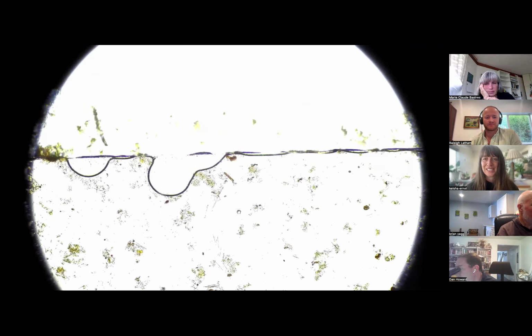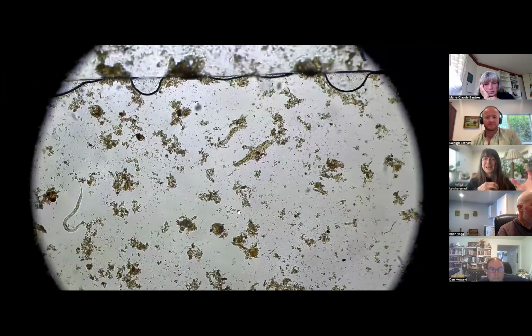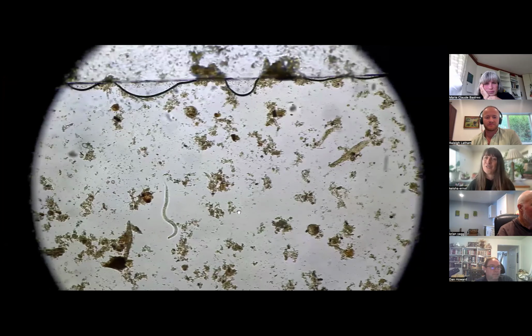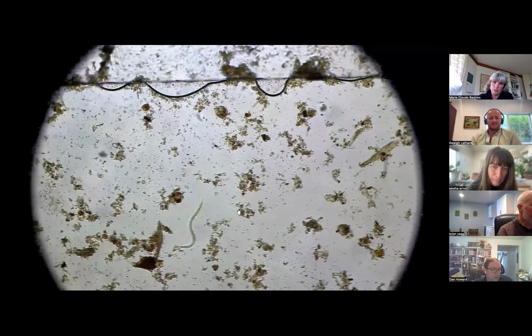you probably still won't get as many per drop, just because of your recipe. But I bet if you take Brian's sample or even your compost and add more food scraps to it, sometimes you'll see like 125 per drop. It's insane.